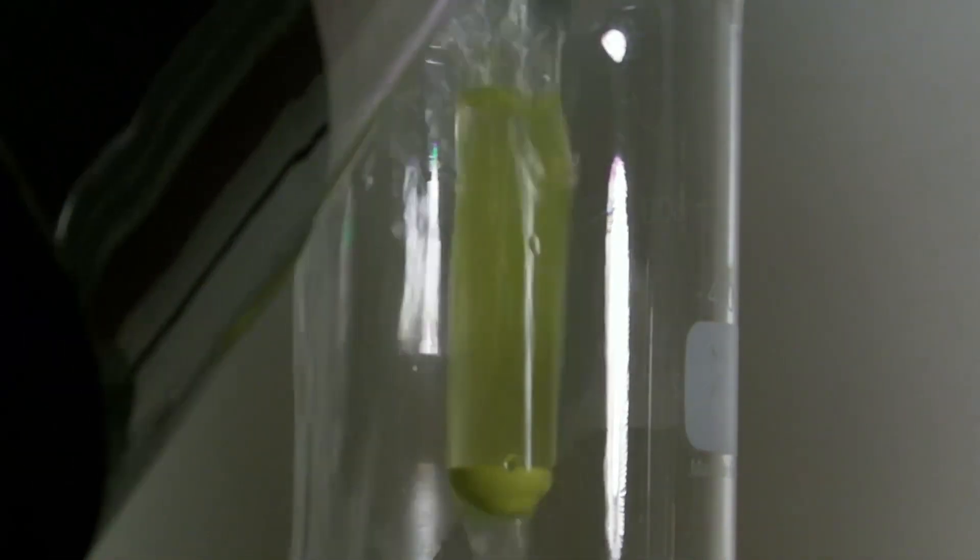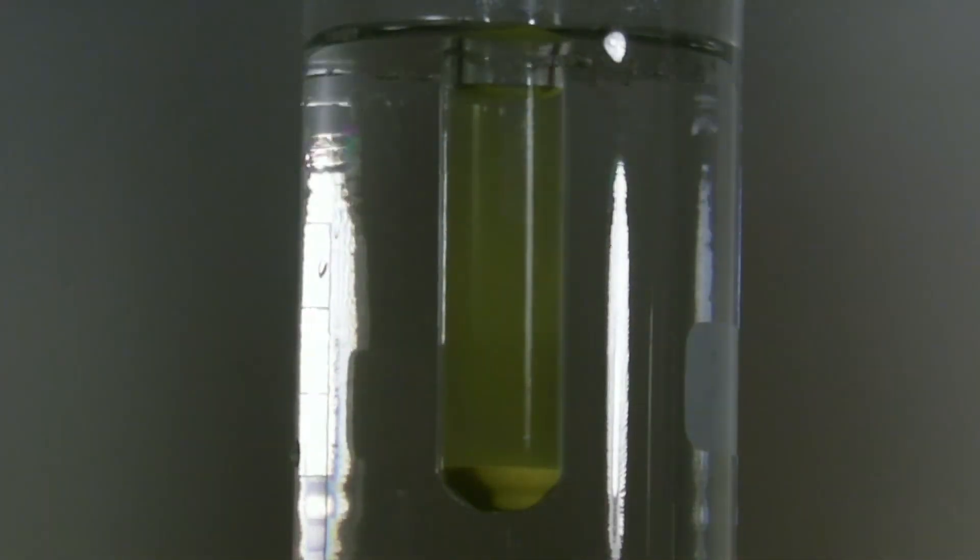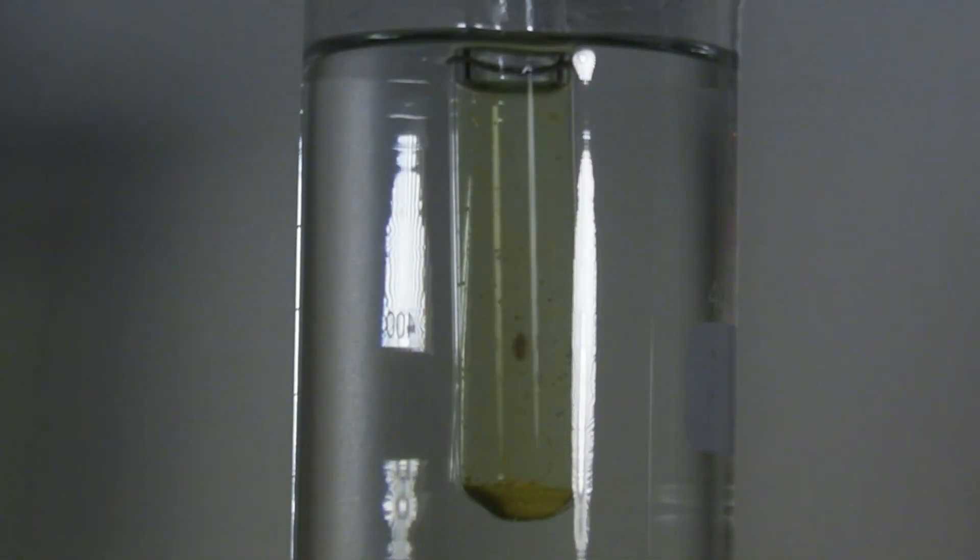When the test tube is heated with boiling water, part of the lead iodide dissolves because it's about 10 times more soluble at this temperature.